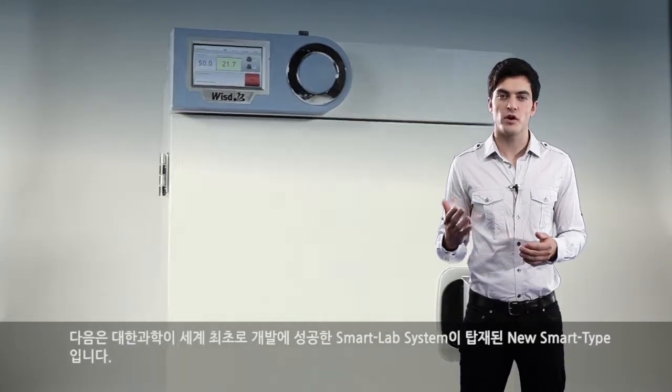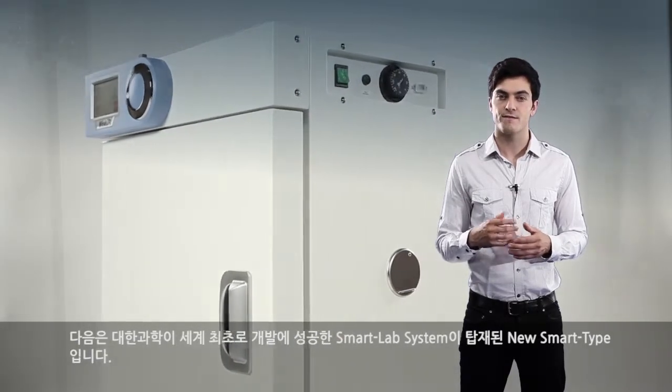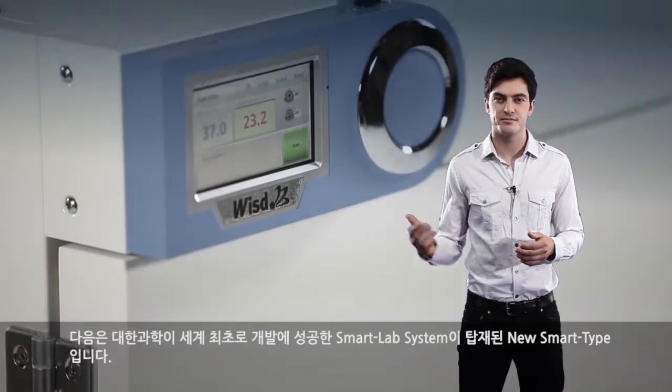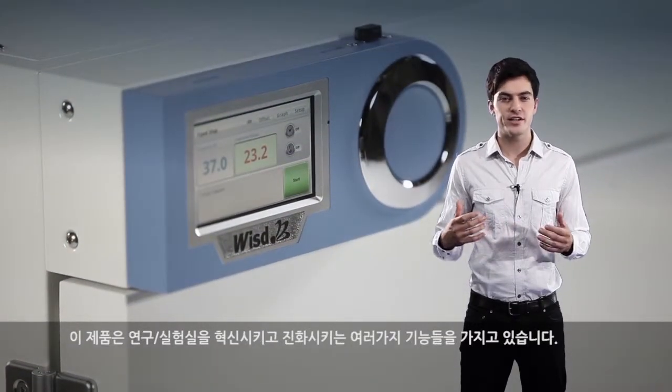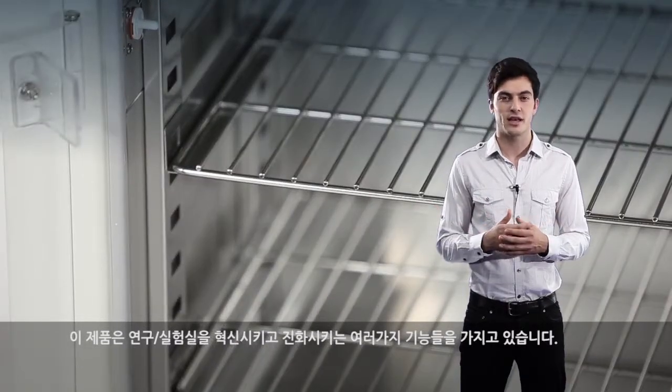Next is the new smart type, which includes Daehan Scientific's world's first successful development of the smart lab system. This includes various functions which can innovate and evolve research and laboratories.